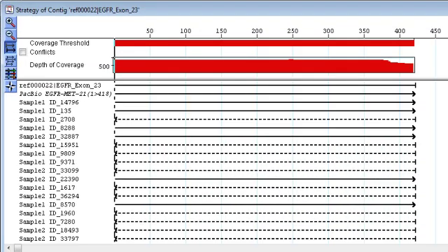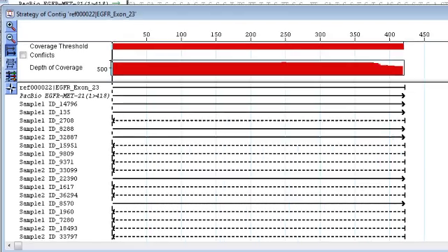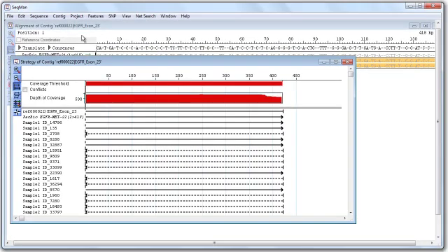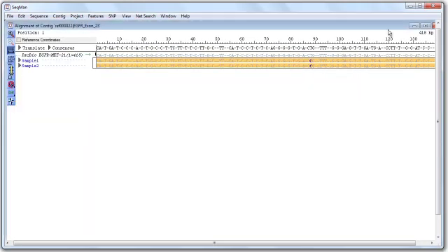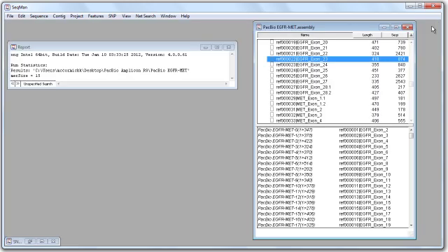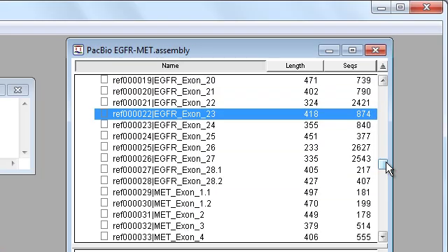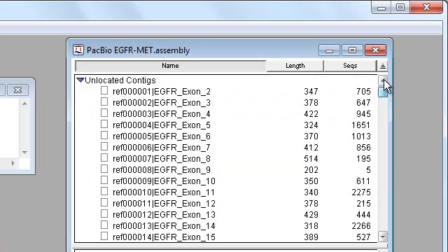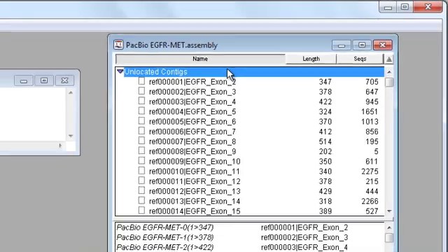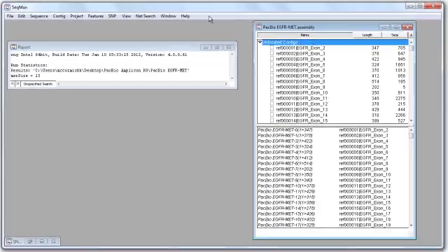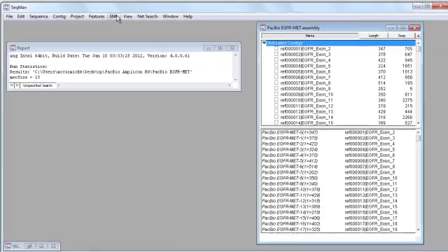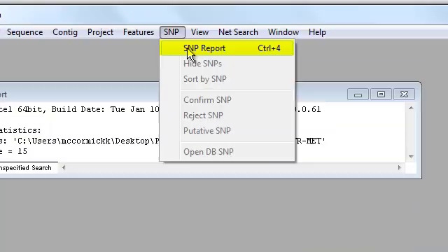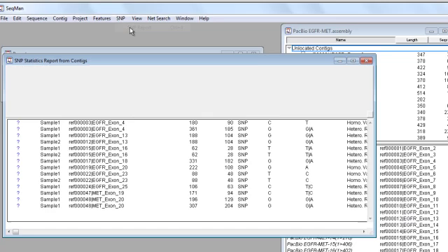This view shows a graph representing depth of coverage along the exon. To see a list of SNPs in my project, I'm going to go back to the Project Summary window. Scroll up and select Unlocated Contigs so all contigs are included, and then go to SNP, SNP Report.